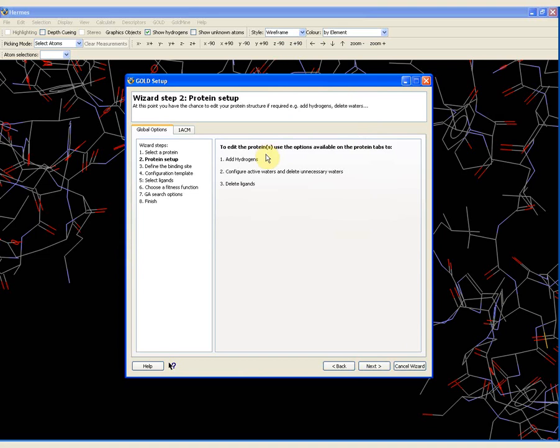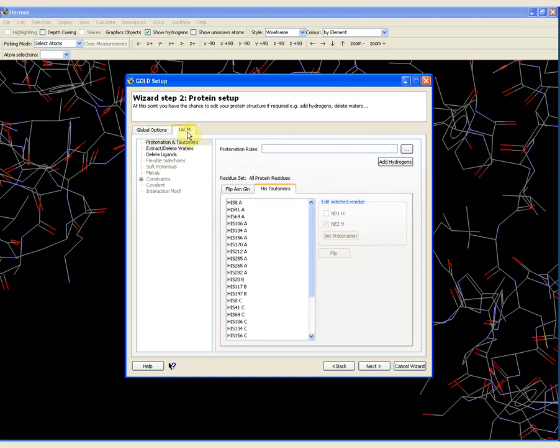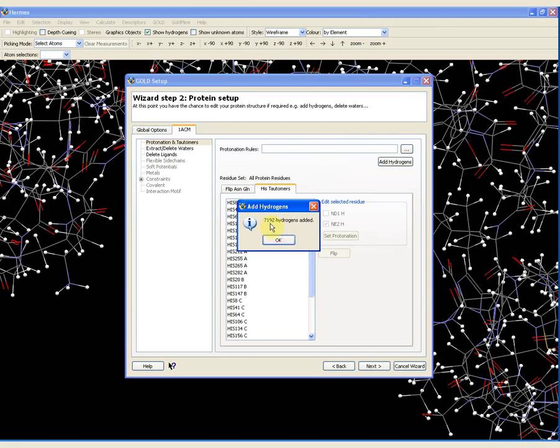It then tells me that I need to do three things with the protein: add hydrogens, configure the water molecules, and deal with the ligands. To do that, I need to go to the Protein tab — this is the tab labeled 1acm, the name of the protein. If I click on it, I am presented with the option to add hydrogens. This is very important — GOLD absolutely requires that both the protein and the ligand have all hydrogen atoms added, otherwise it cannot work. If I press add hydrogens, it now tells me that 7192 hydrogens have been added.